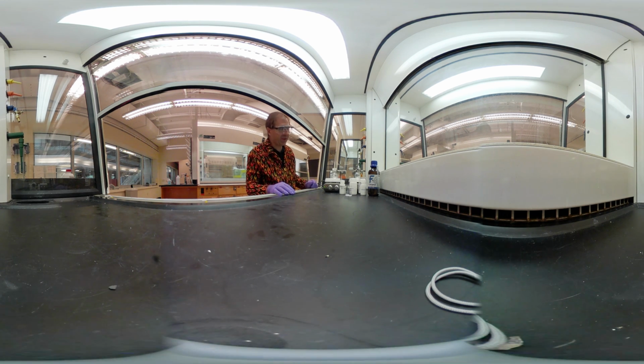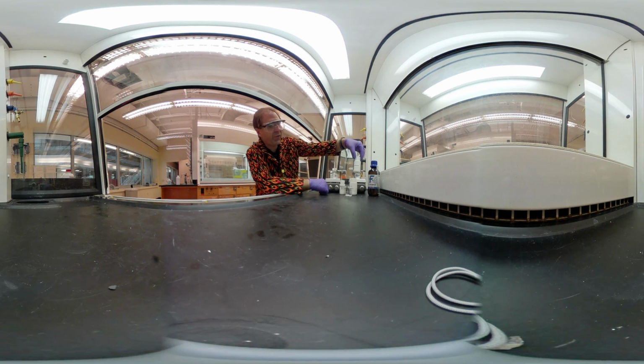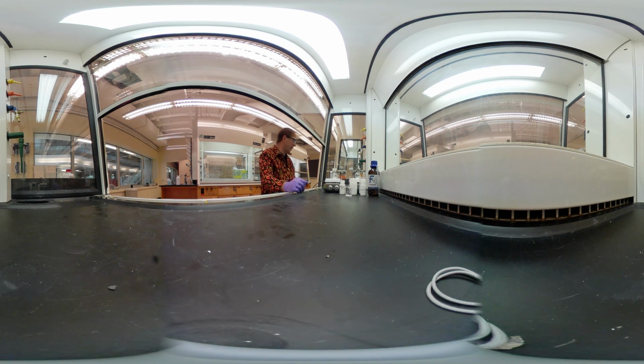Okay, so we have several things that we have here. We need to prepare our dienophile, however, and so we have this 4-phenylurazole, and I've already pre-weighed this into my round bottom flask, and I put in about 0.85 millimoles of that. That's going to be my limiting reagent in this reaction. I'm running it twice so that in a moment I can react it with two different dienes, and we can see what we get. Then the problem is we're not quite yet at our dienophile.